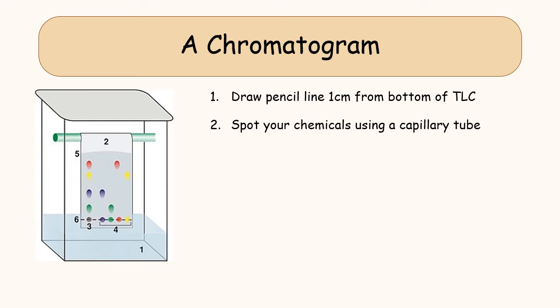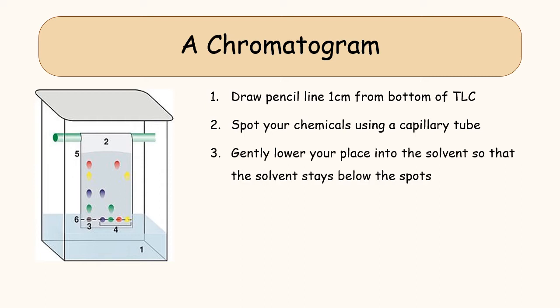spot on the slide. You've got to remember, most of the chemicals you'll be working with when you're doing TLC are colorless, so you'll only see sort of like a wet patch for your spot at the start, which will eventually dry and your plate will look like it's got nothing on it. When you've done all the spots that you want to test, and sometimes you need to do more than one spotting on top of each other just so you get enough compound in the right place.